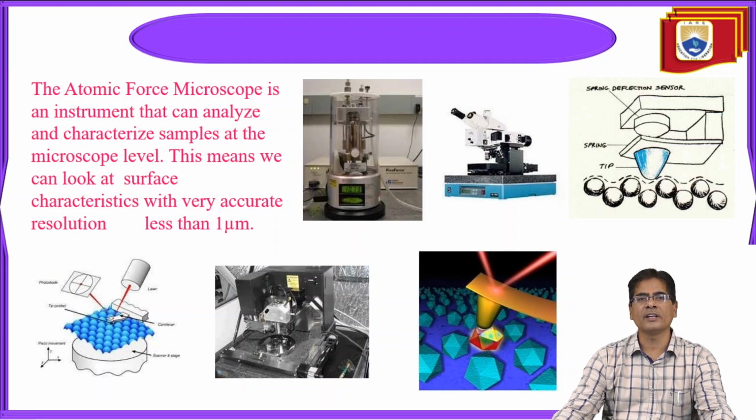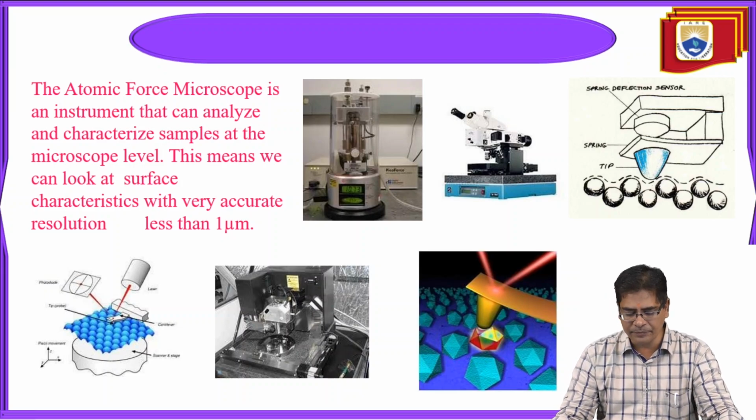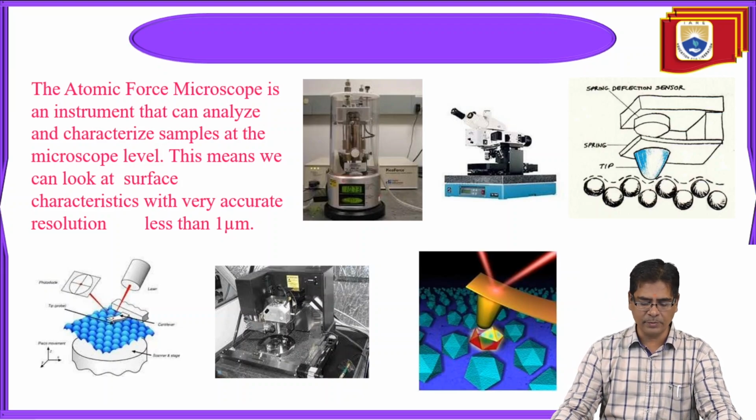This means we can look at surface characteristics with very accurate resolution, less than 1 micrometer. So this is what atomic force microscopy is.